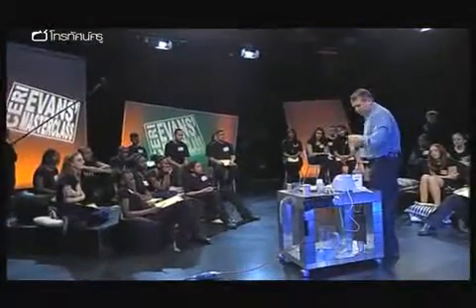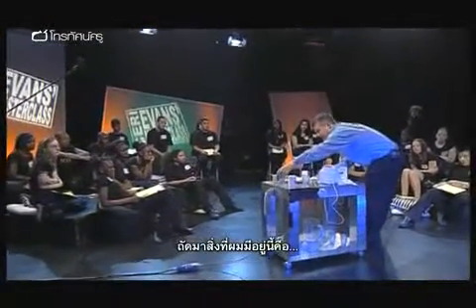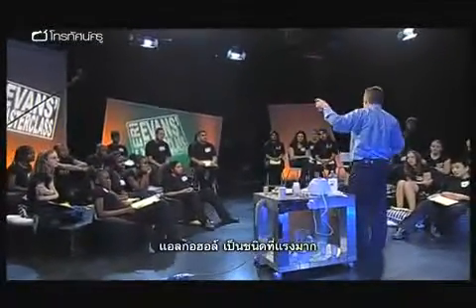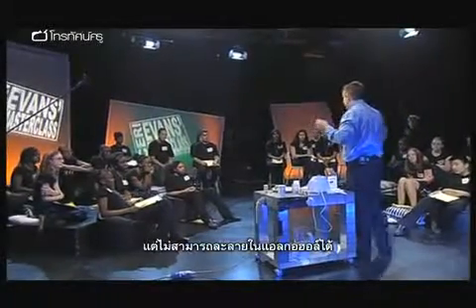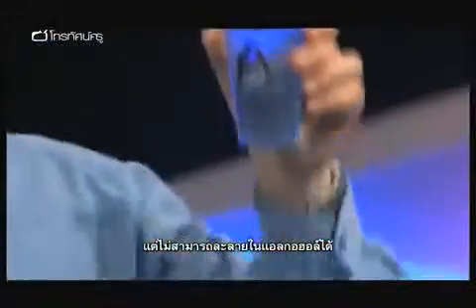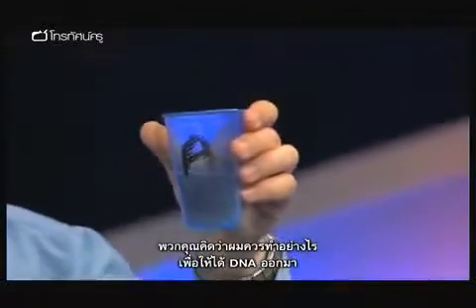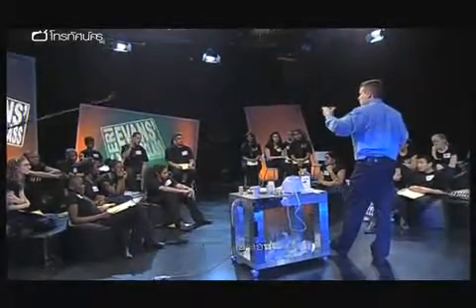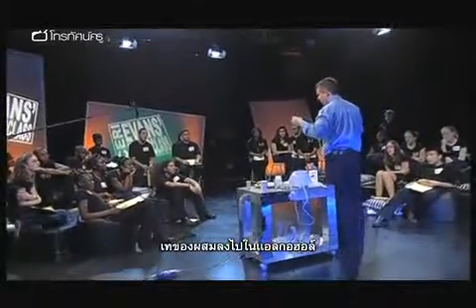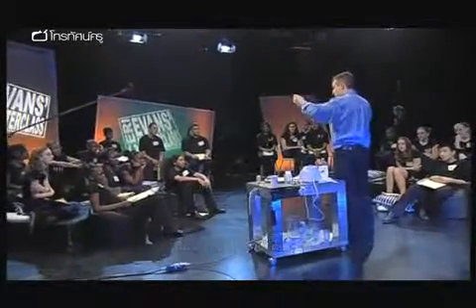Now, what I have here is some very, very strong alcohol. Although DNA is soluble in water, it is insoluble in alcohol, insoluble. So what do you think I can do to get the DNA out of there? Yes, Sean. You pour it into the alcohol. Pour it into the alcohol, very, very good. Or I could pour the alcohol into the DNA.